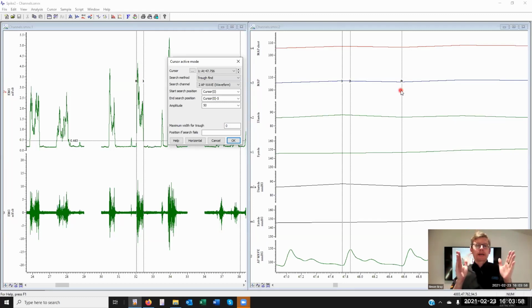And then because I've bracketed this area, this cycle, I've chosen cursor 2 to go and find not the peak, but the maximum value between those two cursors. There's no chance of failure, or I can't think of a way that technique would fail, you see. Okay, so what do we then do?